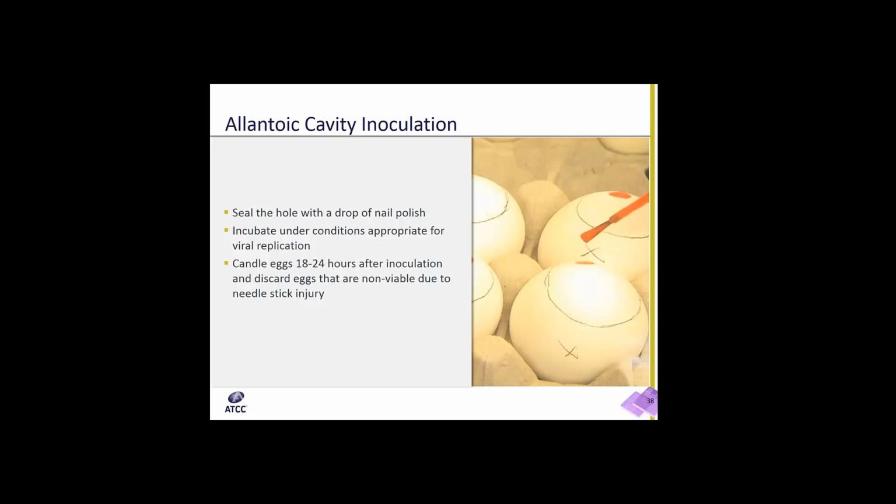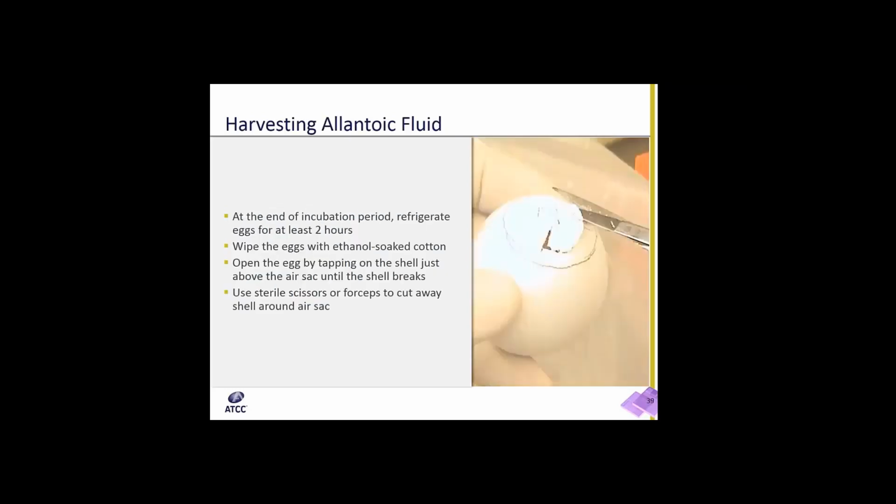And then when the nail polish is dry, you move your eggs into the incubator and incubate under conditions appropriate for viral replication. Candle the eggs 18 to 24 hours after inoculation. Discard any eggs that are non-viable due to needle stick injury. At the end of the incubation period, refrigerate eggs for at least 2 hours. This will help constrict blood vessels and prevent blood from contaminating your virus and your allantoic fluid when you harvest.